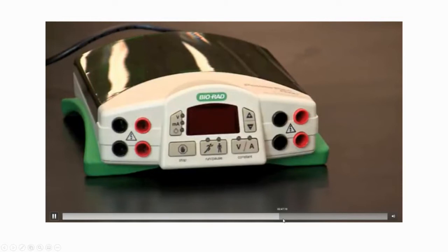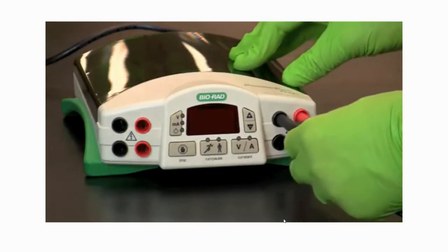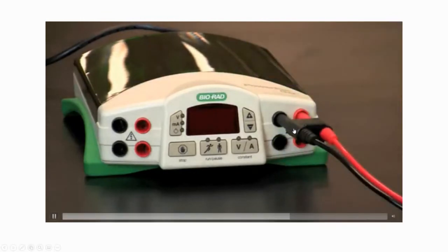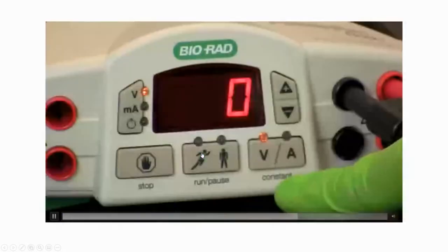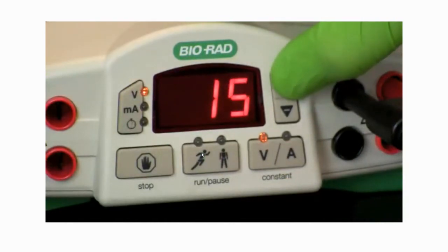Connect the electrodes to the power supply, again making certain the electrodes match the terminals on the power supply, red to red and black to black. Black is negative, red is positive. Switch the power supply on, then set the correct constant voltage for running the samples. See your lab protocol for this information.